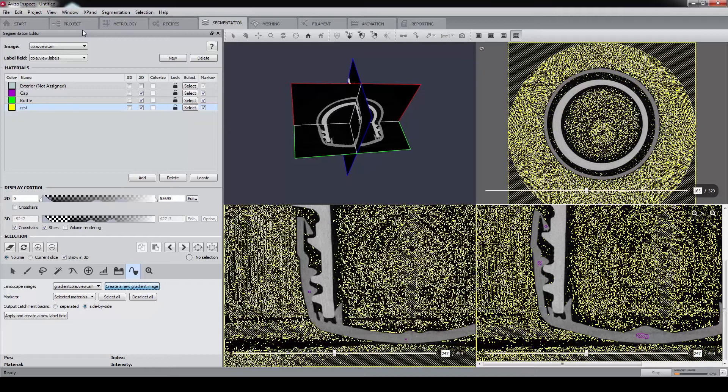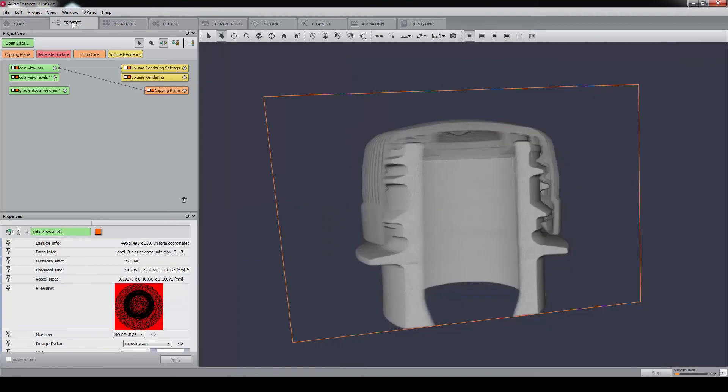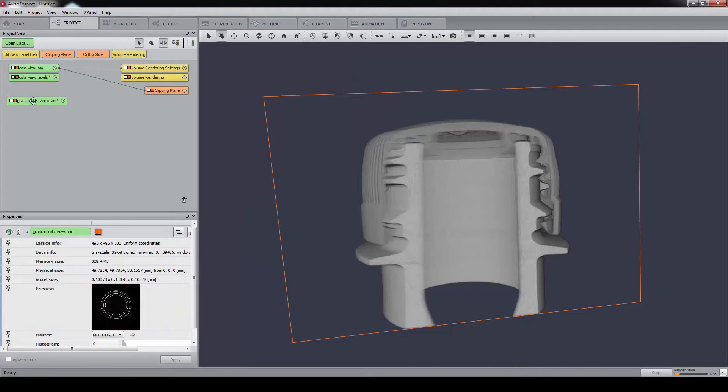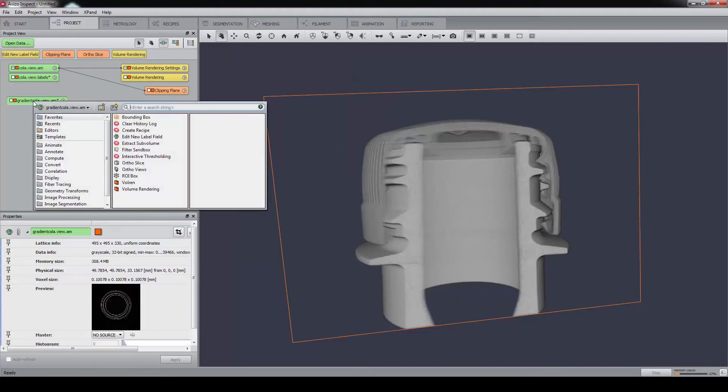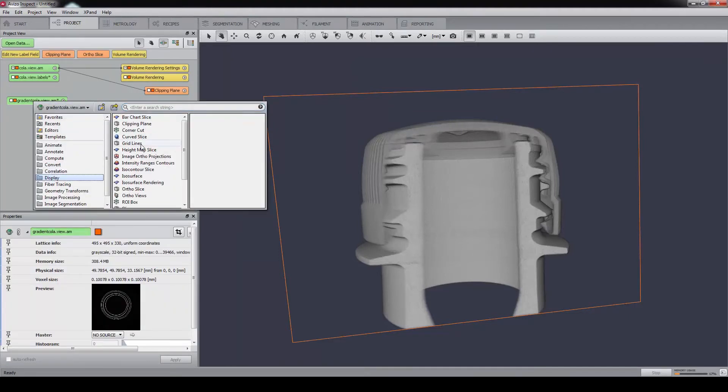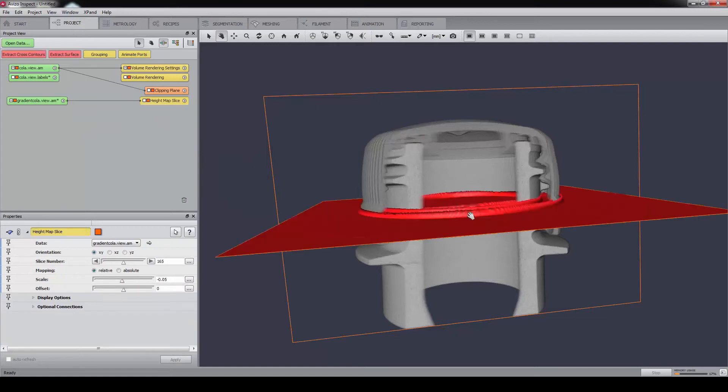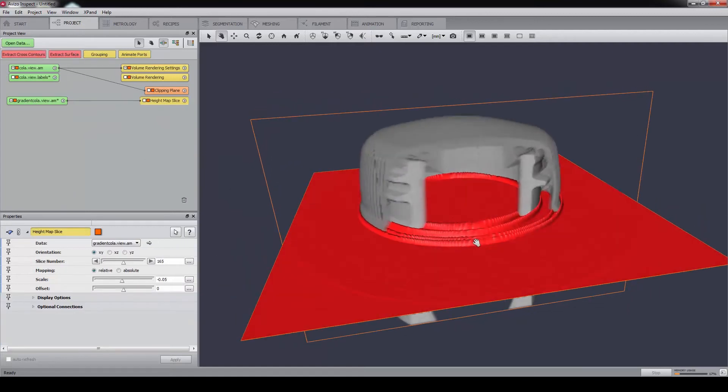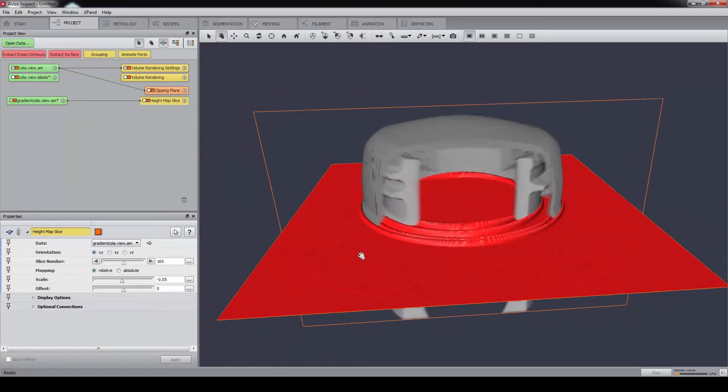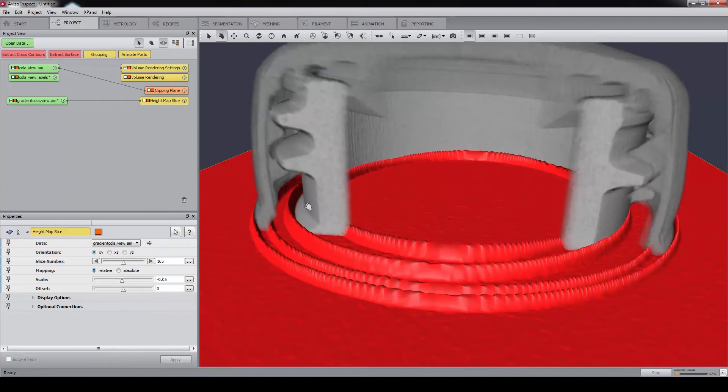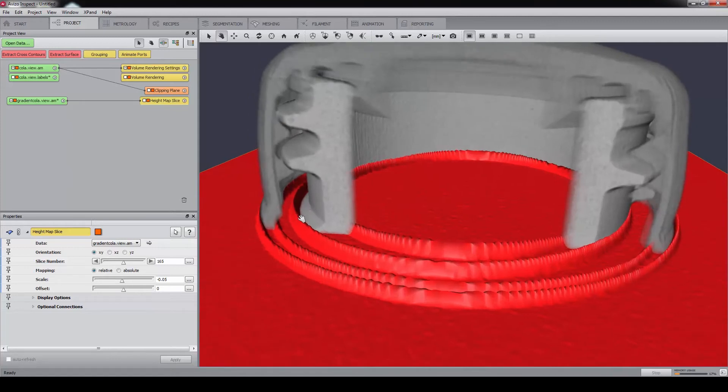To understand the principle of the watershed algorithm, let's go back to the project view and visualize the gradient with the height map slice module. You will see that where there are contrast changes in the gray level, there is a peak in the gradient's magnitude.